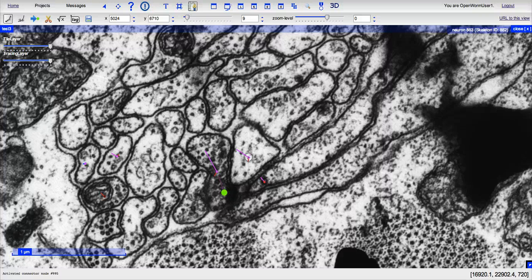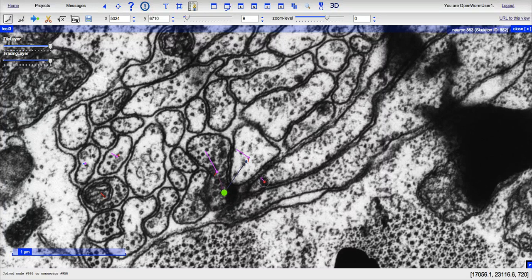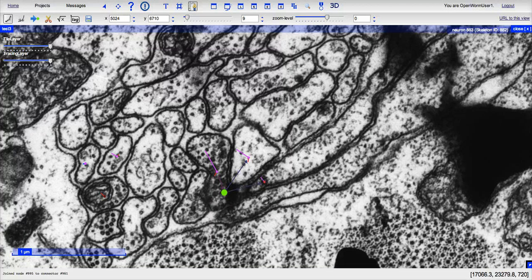Once you've done the first click, you'll see this purple arrow show up. Then you can click on the postsynaptic partners in a row, which will create this connector node, as you see.